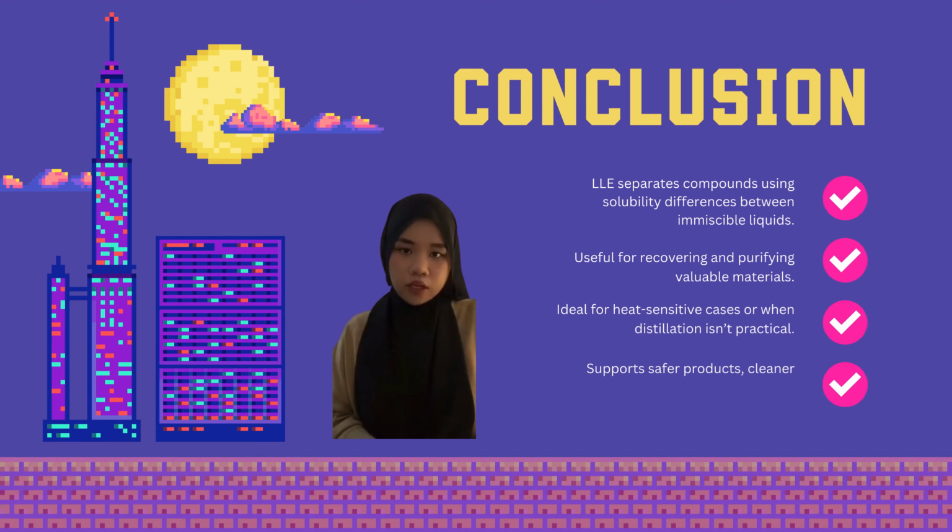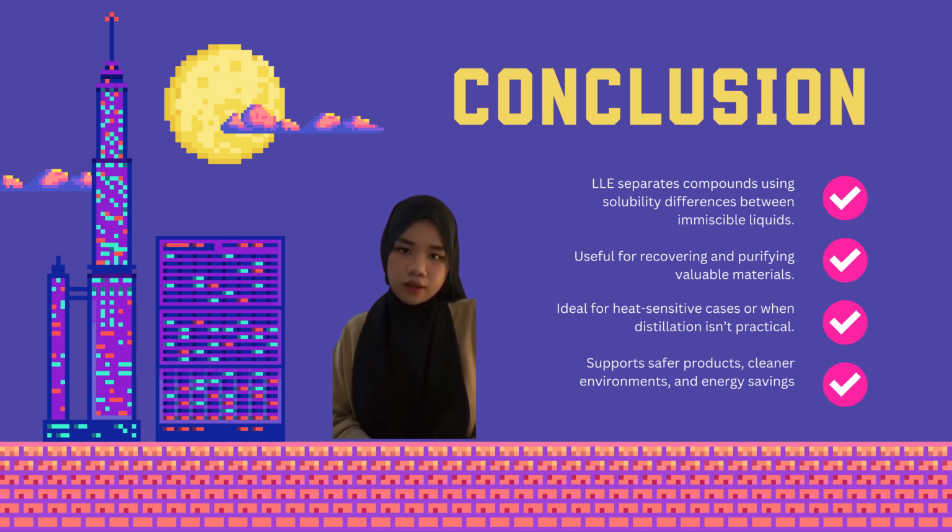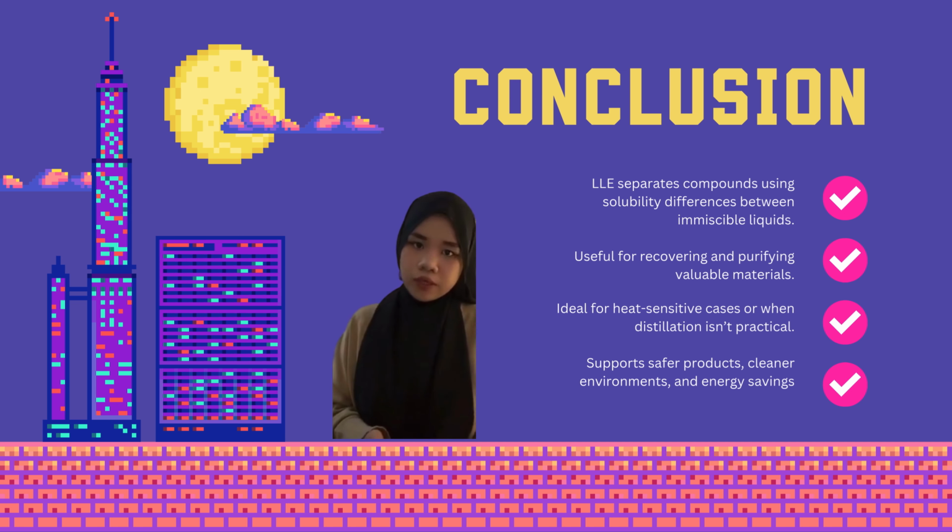To wrap up, liquid extraction, or LLE, helps separate compounds based on their solubility. It is great for recovering valuable materials, especially when heat is a concern. In industry, it leads to safer products, cleaner ecosystems, and better energy use.